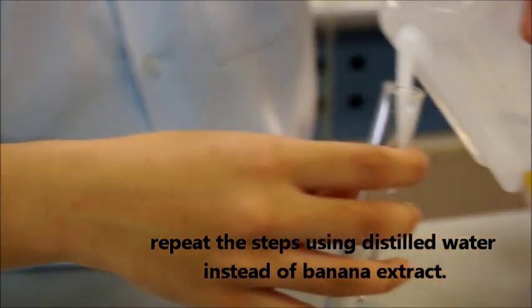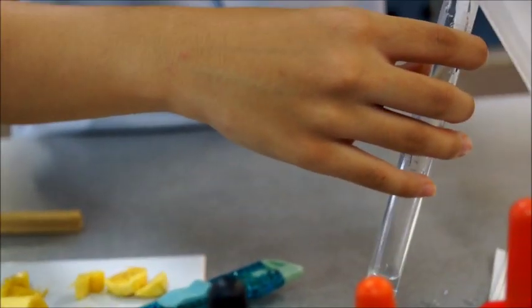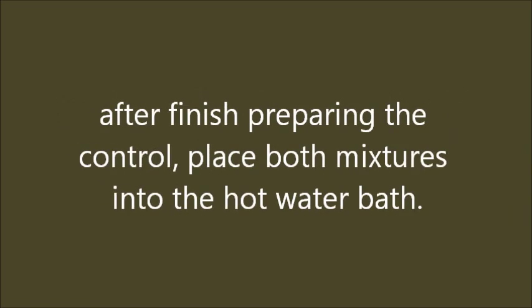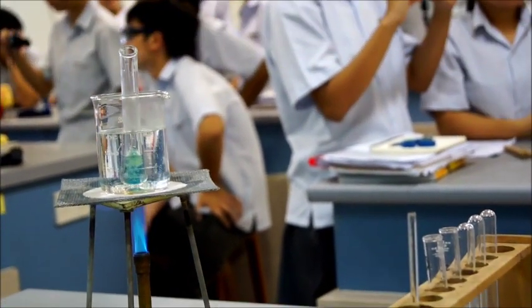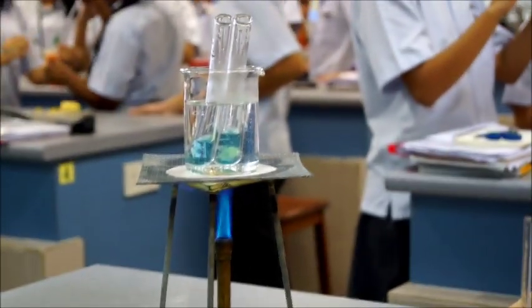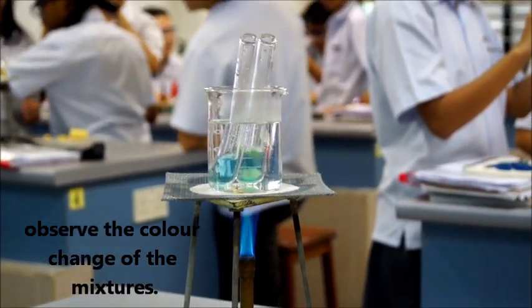Set up a control. Repeat the steps using distilled water instead of banana extract. After finishing the control, place both mixtures into the hot water bath. Leave both mixtures to sit in the hot water bath for 5–10 minutes. Observe the color change of the mixtures.